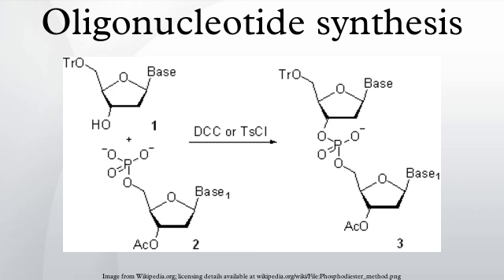For the complete removal of the linker and the 3'-terminal phosphate from the assembled oligonucleotide, the solid support 1 and several similar solid supports require gaseous ammonia, aqueous ammonium hydroxide, aqueous methylamine, or their mixture, and are commercially available. The solid support 2 requires a solution of ammonia in anhydrous methanol and is also commercially available.